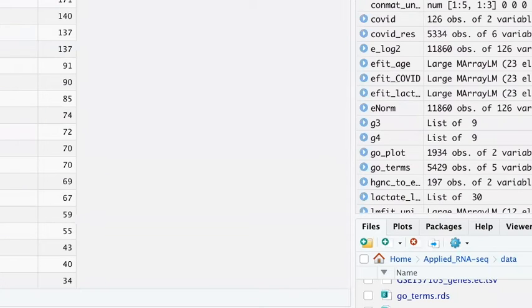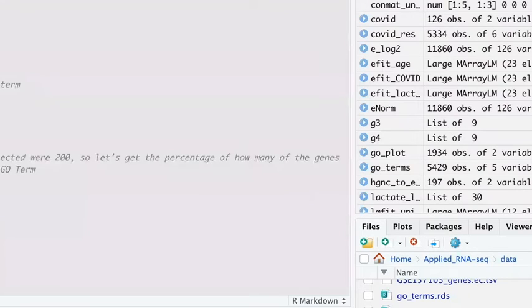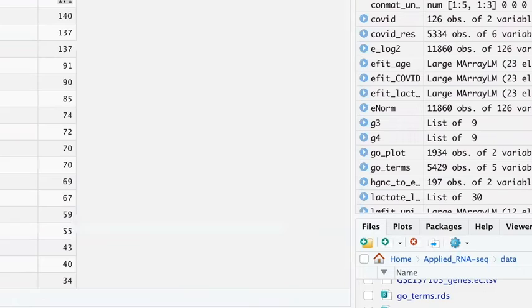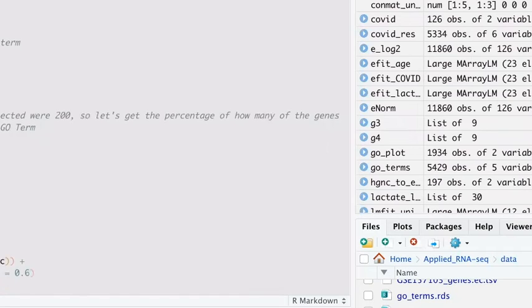So protein binding, of our 200 genes with the multiple GO terms, is the GO term that came up the most, 171 times. And then the rest of them I've arranged by frequency. So count by name_1006, arrange, meaning you want to arrange the column sequentially, but I want it descending, so I have to specify descending, and n is just the name of the column here.